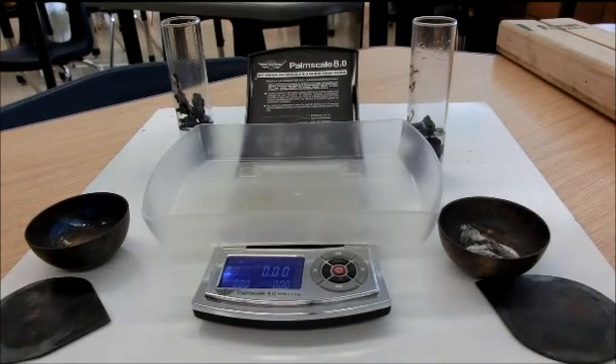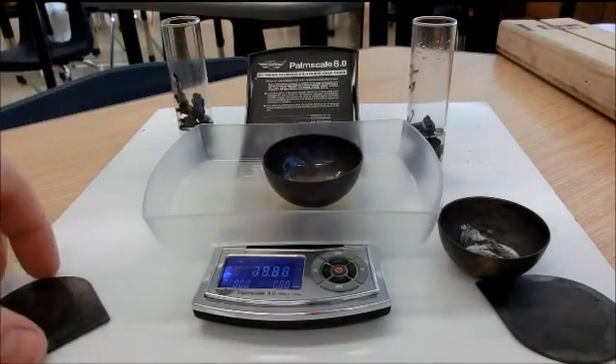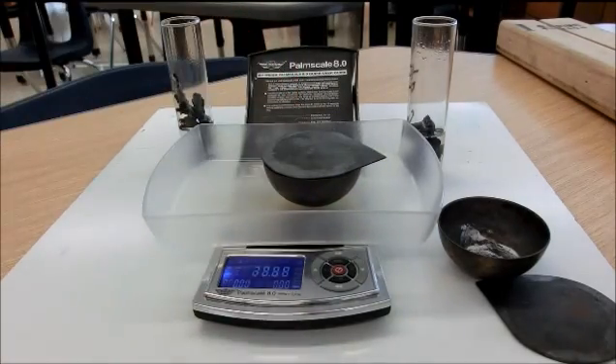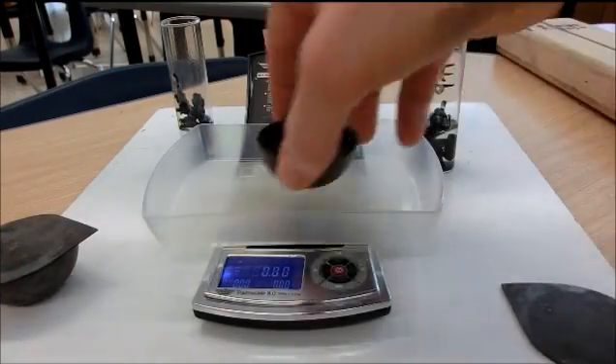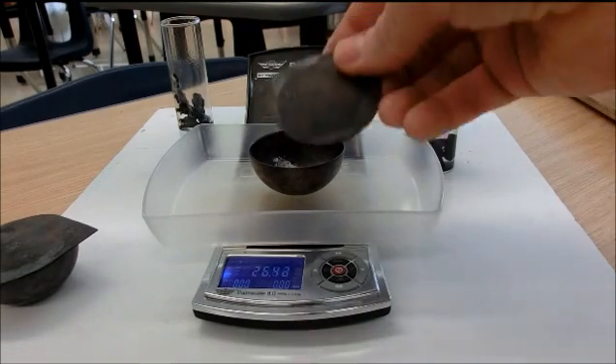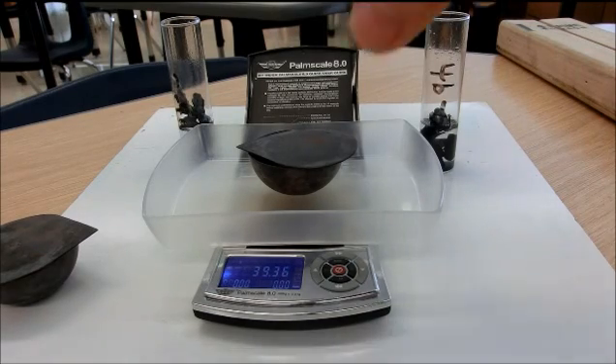I have a crucible and lid for each one of the reactions. The one on this side weighs 40.00 grams. The one for the 4B5 class — or trial 2 if you wish — weighs 39.36 grams.